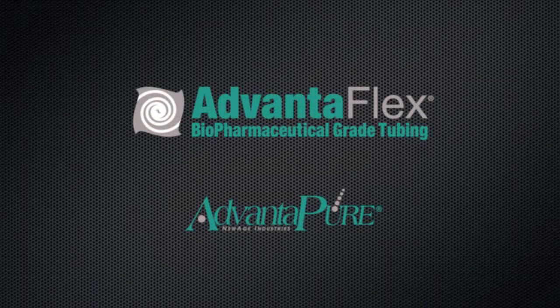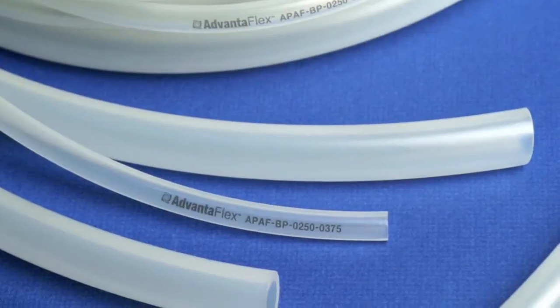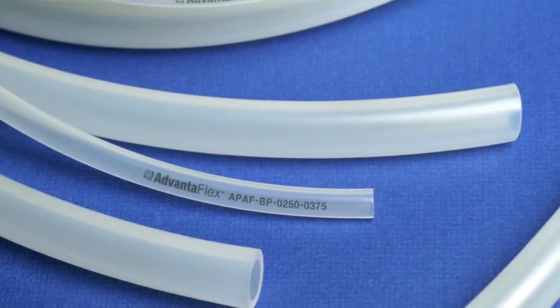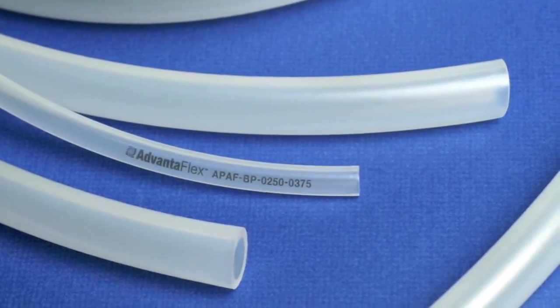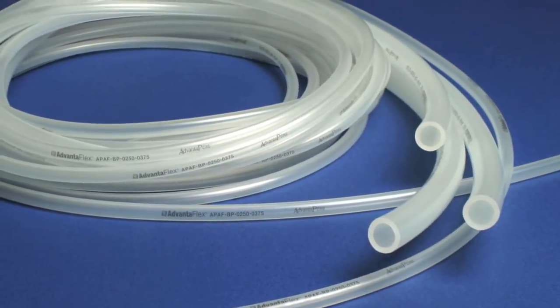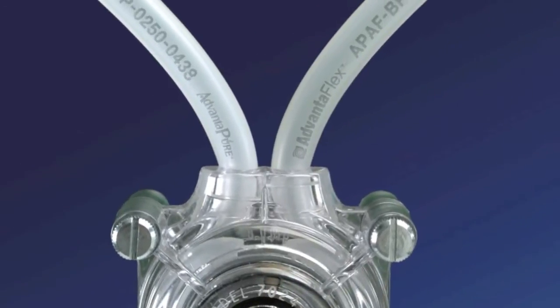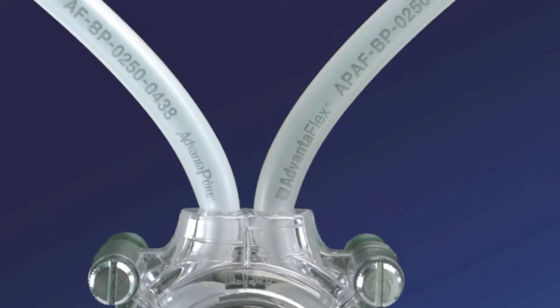Advantiflex from Advantipure is a biopharmaceutical grade tubing developed specifically for critical fluid processing. It's ideal for single-use manifold assemblies, sterile filling and sampling, vaccine production, bioreactor processes, high purity water transfer, peristaltic pumps, and other pharmaceutical and biologic applications.